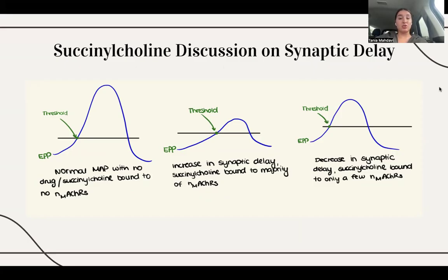First, since the succinylcholine is being added onto the muscle directly, there's a possibility that it did not soak into the middle of the muscle. The muscle is super big, meaning the drug has to travel to get to the middle of it where the NMJs are located. And then if succinylcholine did not reach the middle of the muscle, this means the NMJ is working normally and was not affected. If this were the case, it would explain why there was no notable difference in the synaptic delay between the control and when the drug was added.